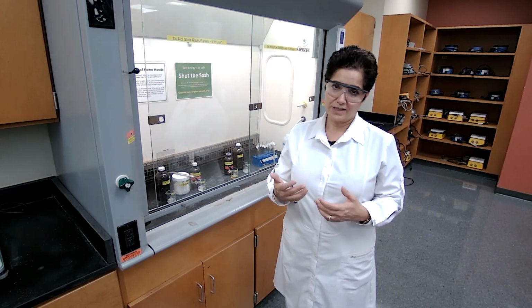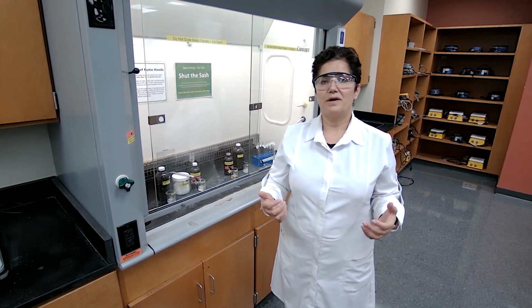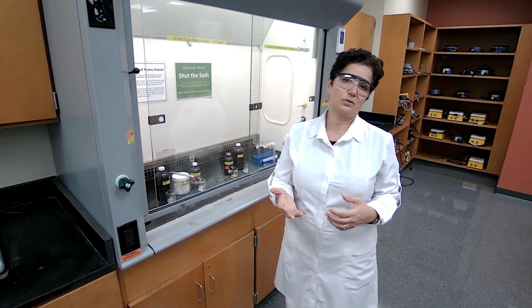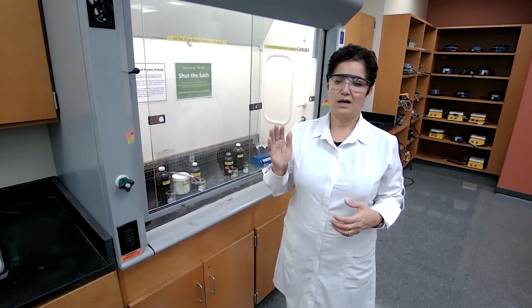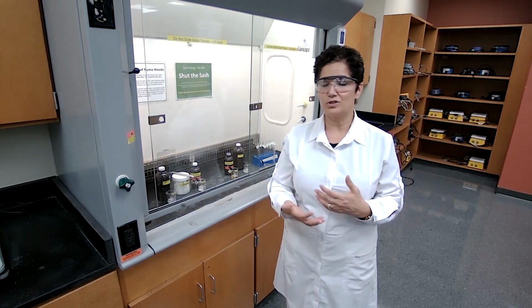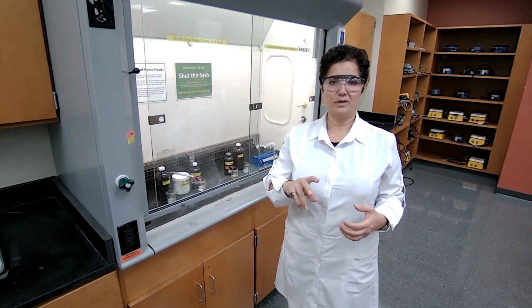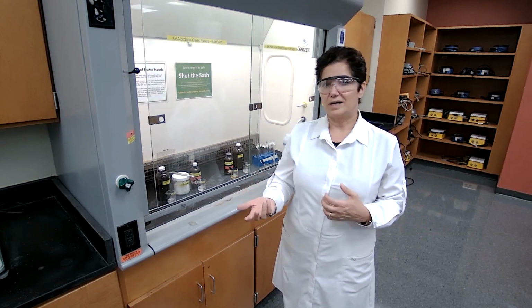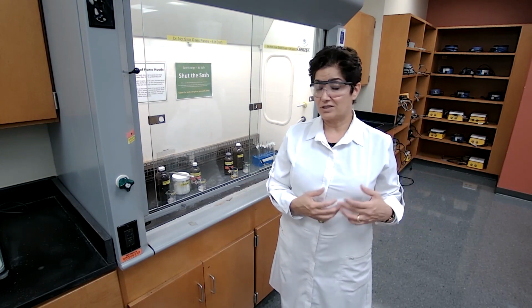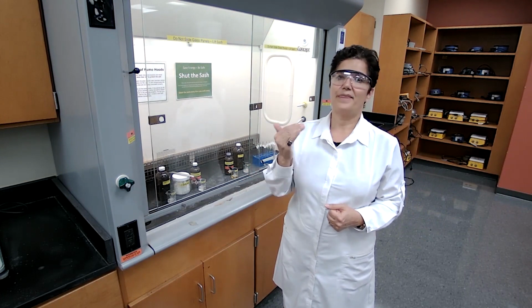We just want to make sure that you do not test solubility in HCl for compounds that are already water soluble, because HCl is 95% water. If the compound dissolves in water, it would definitely dissolve in HCl, so we have no conclusion for the functional group. It could be a ketone with 3 carbons, like propanone, and it would dissolve in water and at the same time in HCl. So it's not going to give information. So first we test solubility in water, then HCl.